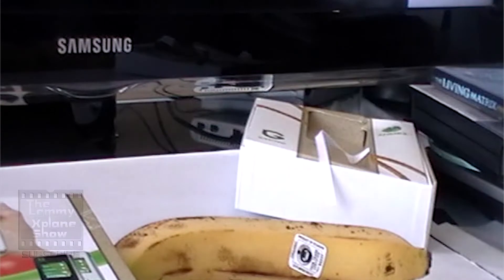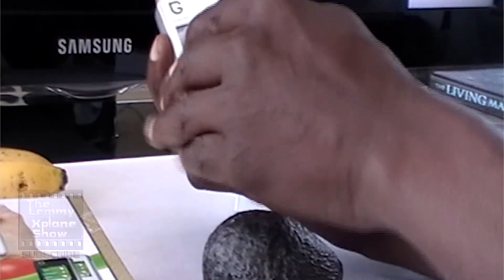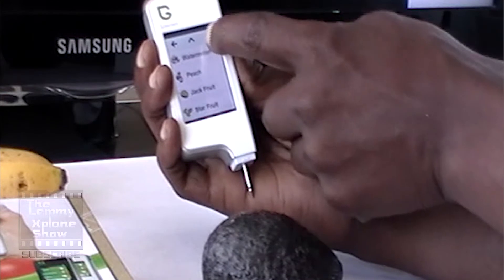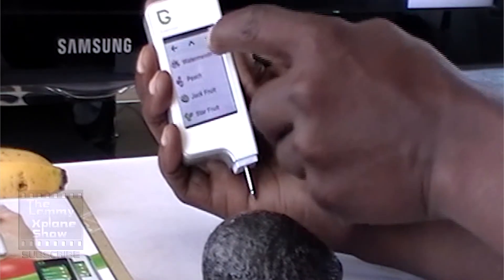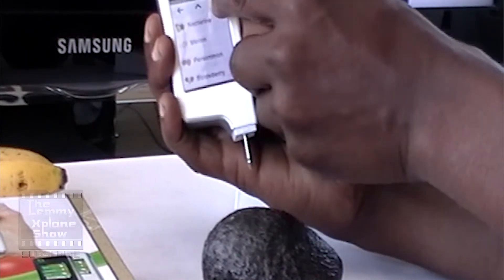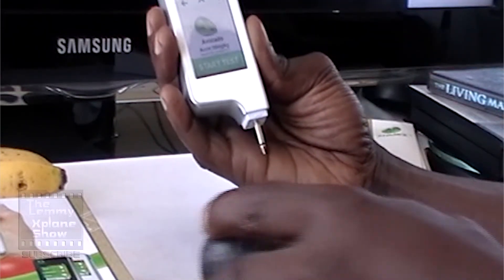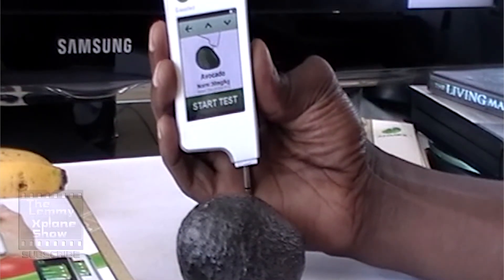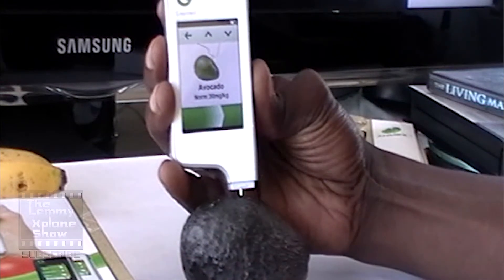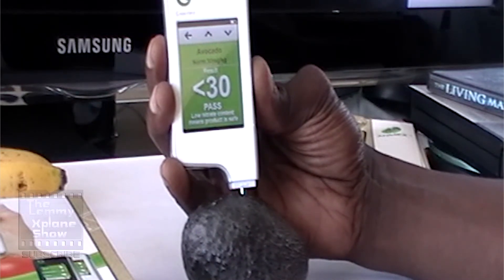The avocado — my favorite fruit. We go back in and look for avocado in the menu. I wish they put it in alphabetical order, or maybe a scroll button on the side where you could toggle up or down. And there we go — that's our avocado. With the avocado, the expected normal is 30 milligrams per kilogram — that's really low. We're going to probe it and hit test. This one has less than 30 milligrams per kilogram, and it passes. That's awesome.